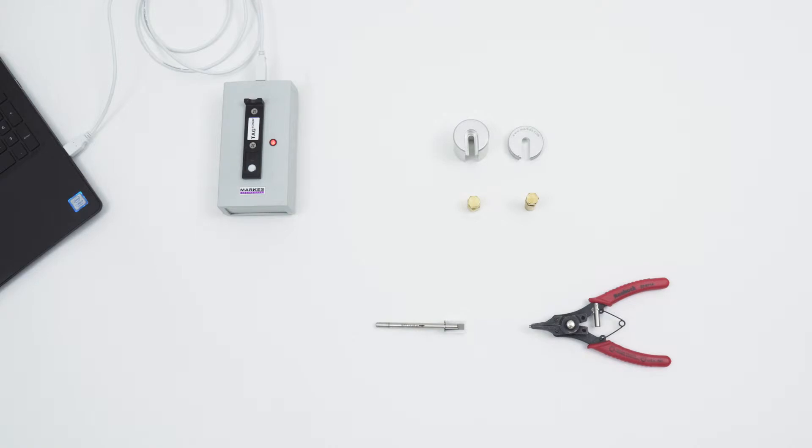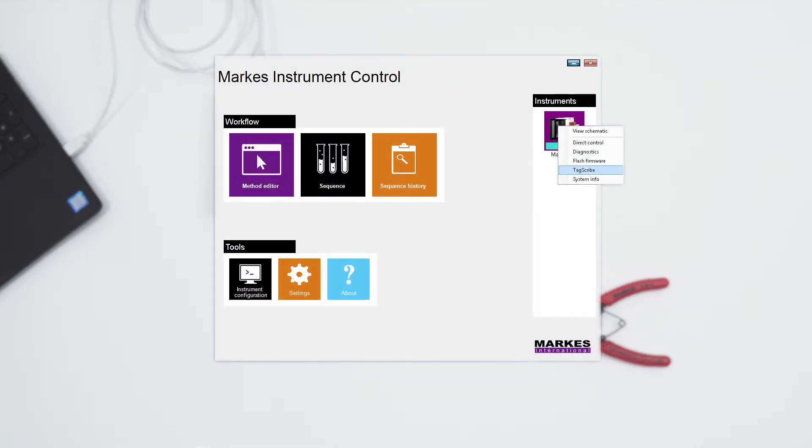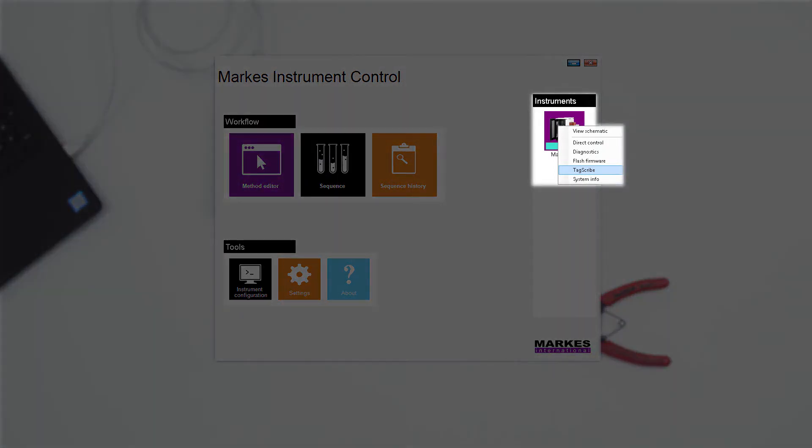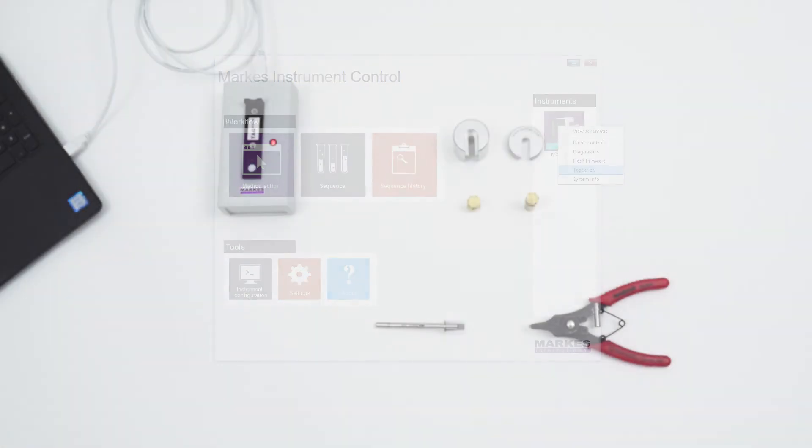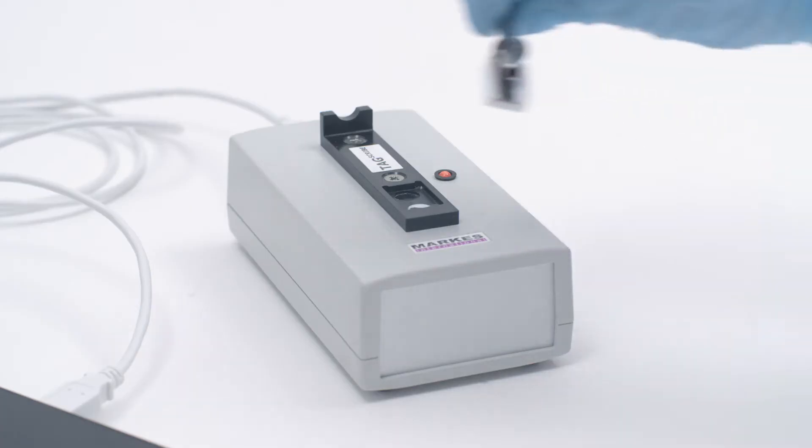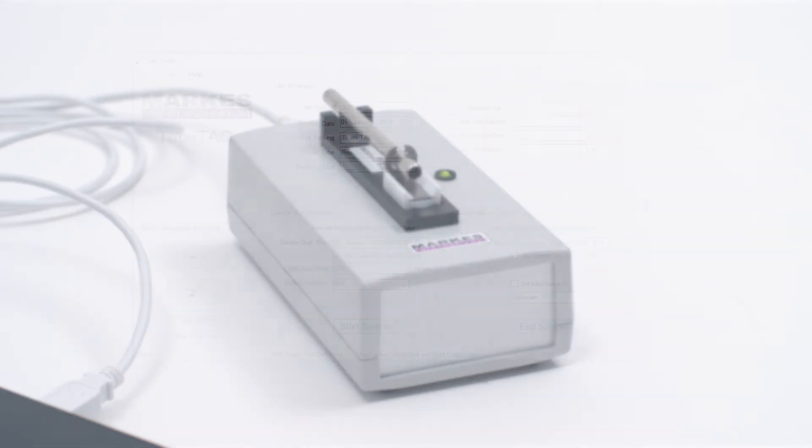You are now ready to write your tag. To do this, plug your TagScribe into a Windows compatible device or load the TagScribe windows in the MIC software by right-clicking on the Instruments tile. Launch the Tag software and load your tube either into the instrument or onto the TagScribe.